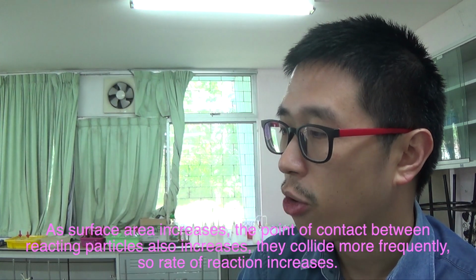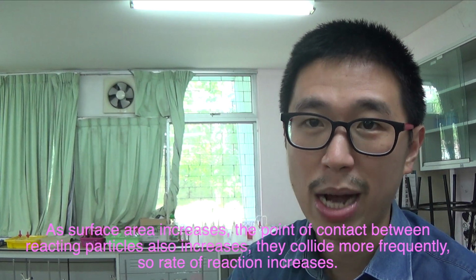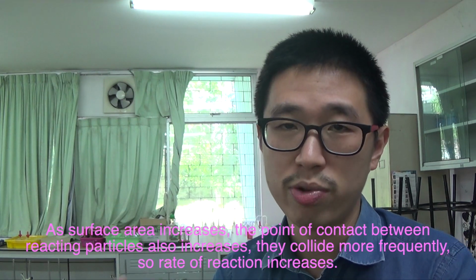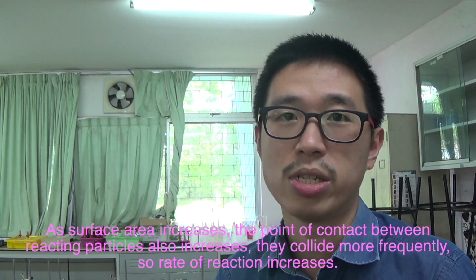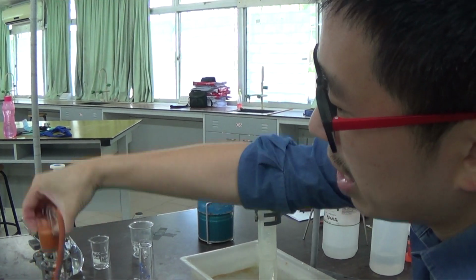So here the lumpy form reacts a lot slower compared to the powdered crushed form because the crushed form has a much bigger surface area. So your point of contact with the acid, with the reactants, is a lot bigger. Bigger surface area results in faster rate of reaction. So the time taken to collect a fixed volume will be shorter. But here we are measuring the volume of the gas produced in a fixed time, and we could see there's a lot more volume of gas being produced in that fixed time from the powdered form. Here, the reaction was basically the acid plus the carbonate.